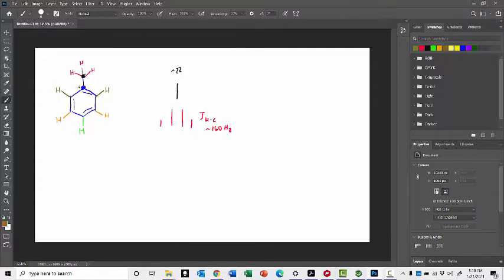So it's the influence of these further out that are playing the role. Now let's count bonds and see how far a distance that is. So from this hydrogen to this carbon, that's 1 bond. From this carbon to this carbon, that's 2 bonds. From this carbon to that carbon, that's 3 bonds. So these hydrogen atoms are 3 bonds away from this carbon, and apparently that's enough to be visible in the C13 spectrum, although clearly at a much smaller J value than the 160 hertz of being directly bound.